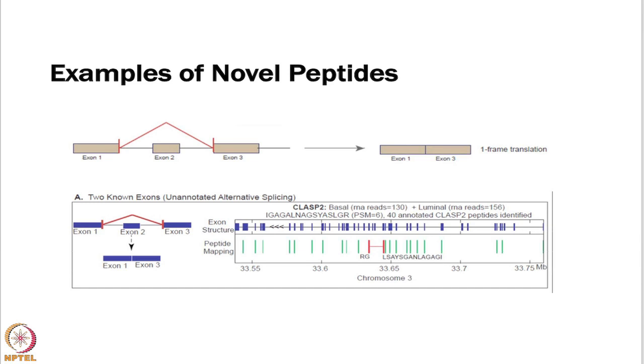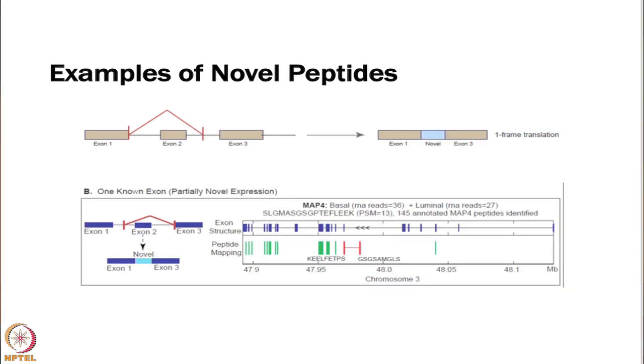You can see here, this is the peptide data, and this is the exon structure. You can see that there is actually evidence for this at the peptide level, where you're connecting this exon with another exon that's known but did not have annotation already in the database for that connection. Or a connection between an exon and some intergenic region. So here's an example where we have an exon that's annotated connected to this intronic region here. And there's evidence at the peptide level for this connection because we added this into the database.